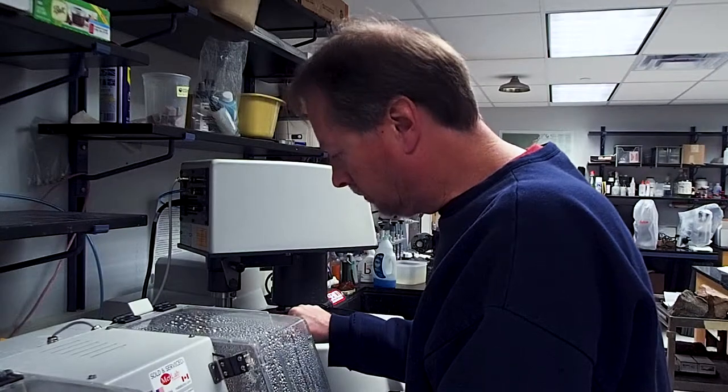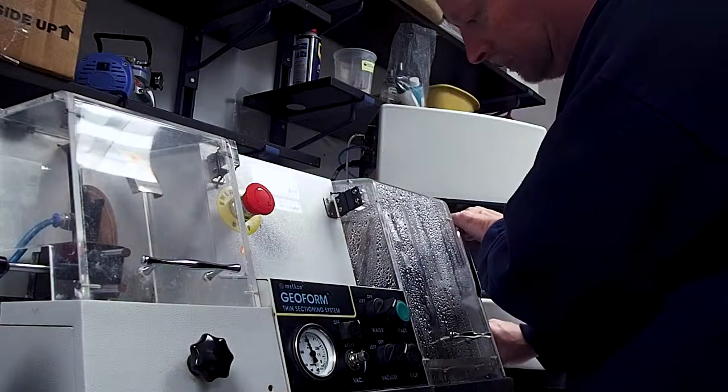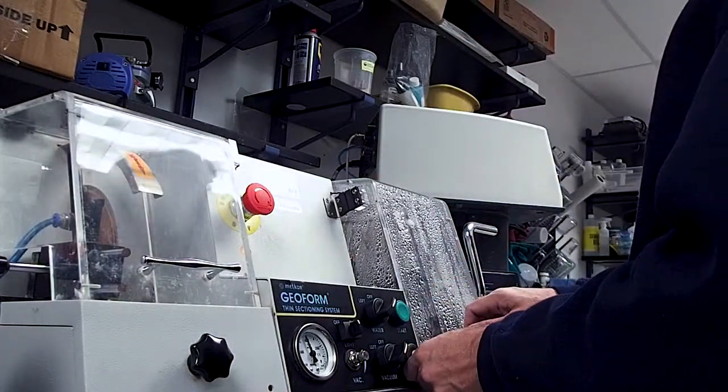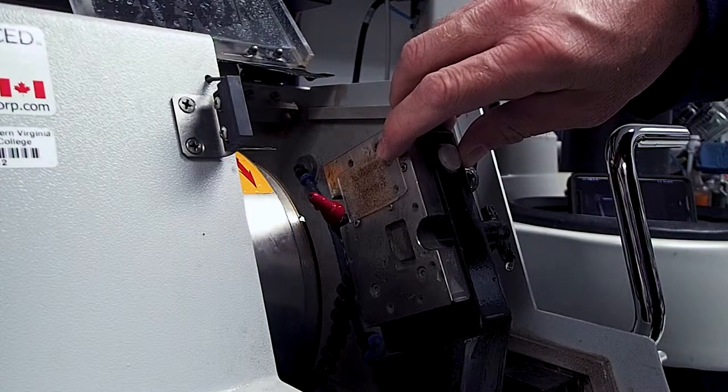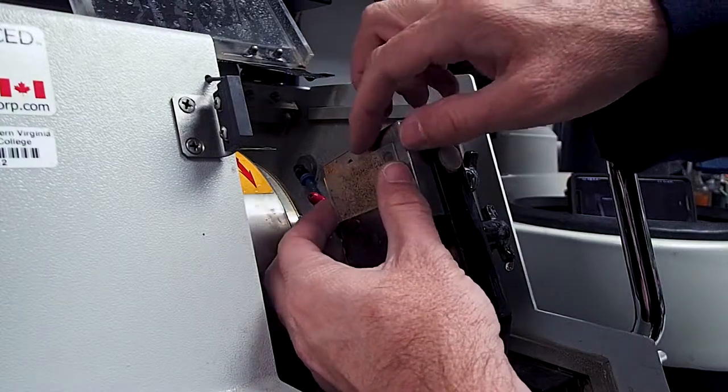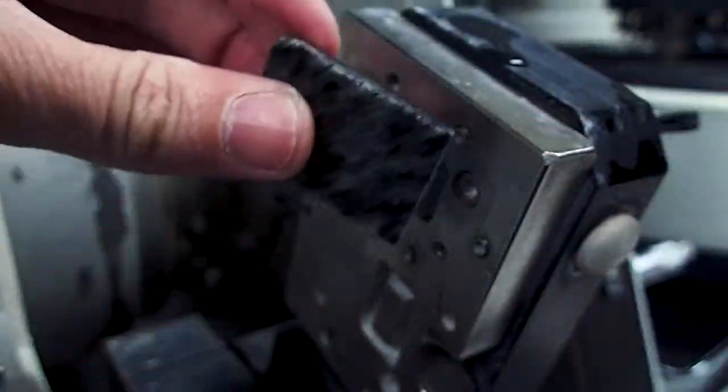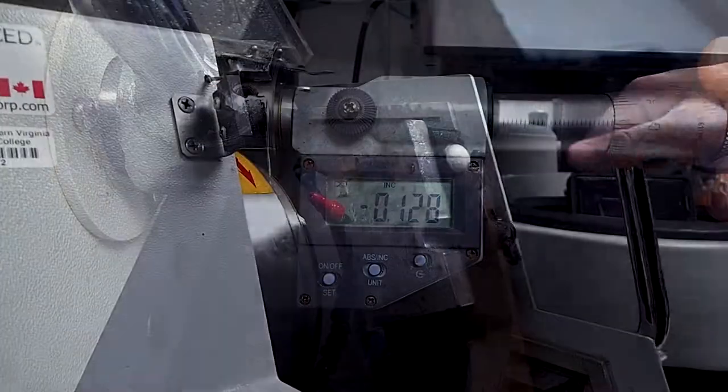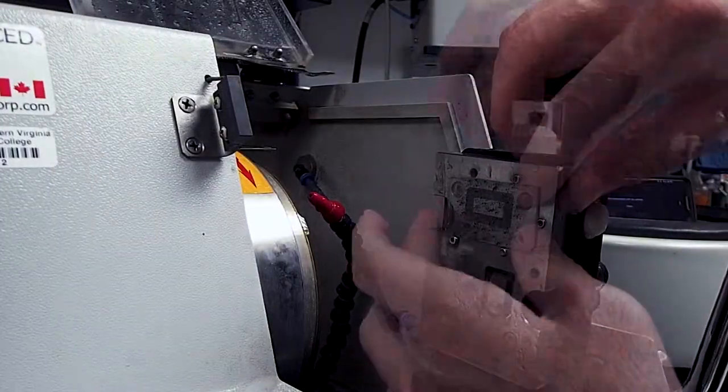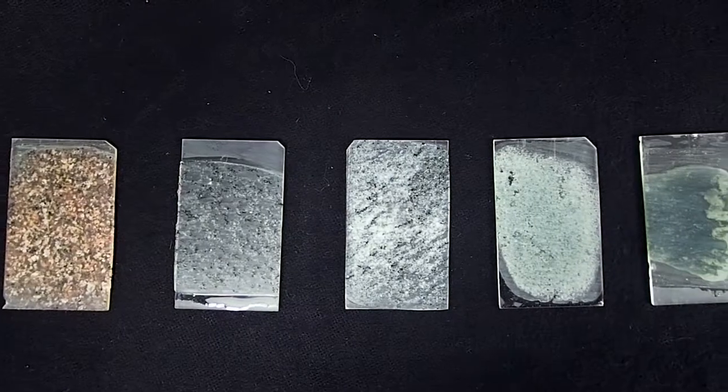Once your sample has been ground down to a thickness of 100 microns or less, it is time to pull the slide from the equipment. Using the side arm, carefully move the sample away from the grinding wheel before turning it and the water flow off. Make sure you have a grip on your slide before turning off the vacuum and carefully pull it from the vacuum chuck. If you have additional samples to grind, simply repeat this process for each one. Once all of your samples have been ground down to a thickness approaching 30 microns, they are now ready for the final grinding stage using glass plates and powdered grit.